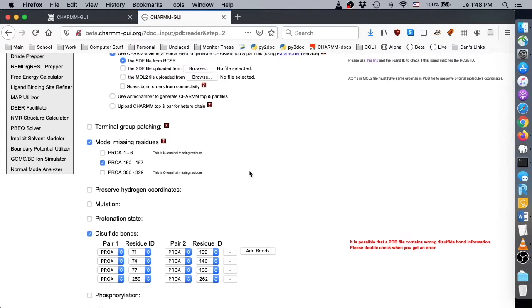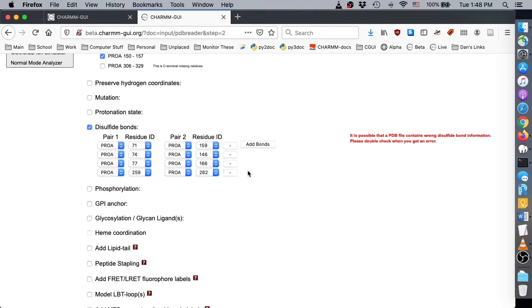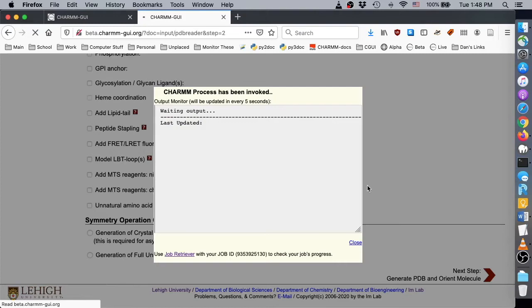Check whether the disulfide bonds are defined correctly. When everything looks correct, click Next to begin PDB manipulation. Make sure to save your job ID to allow checking your job progress with Job Retriever or returning to earlier steps to modify your options.